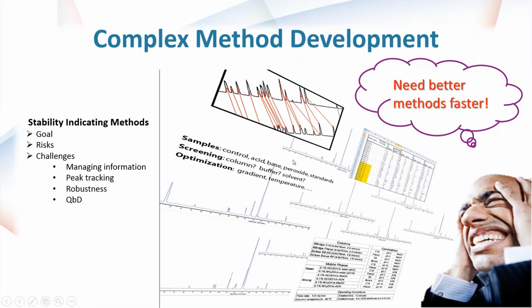While Charlie is a hypothetical persona, we have encountered countless individuals with the same challenges, and I expect that many of the attendees of this webinar can relate. In fact, we worked very closely with a number of individuals like Charlie at different companies, including Janssen Pharmaceuticals and Eli Lilly & Co., to develop and iteratively refine an automated software solution that directly addresses these challenges.